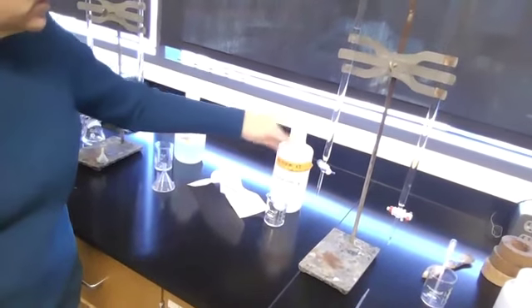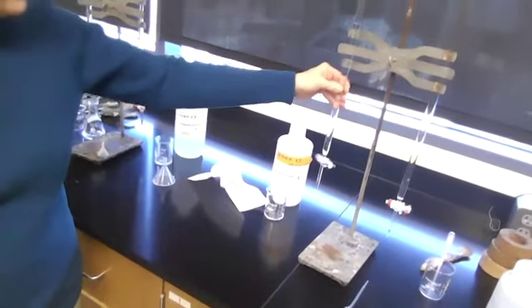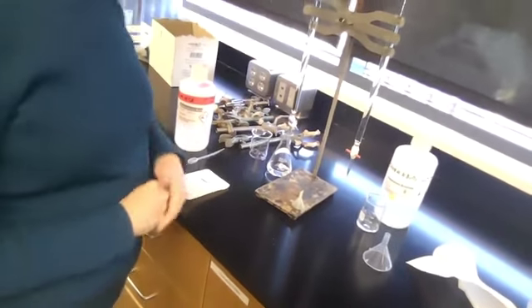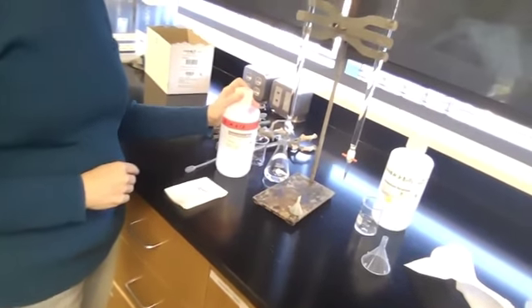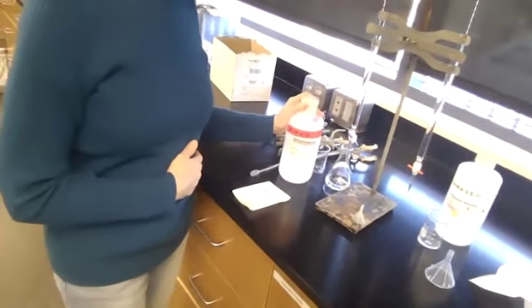Our second reactant is potassium iodide. And those two are mixed in a flask together that we have nominally called flask number 1. Since we're varying the KI amount, we'll add in water to make the volume constant. Every experiment will have a total of 50 mL. In the second flask, we will have potassium bromate as one solution and hydrochloric acid as the other solution. And then we have added a little bit of starch for our indicator.